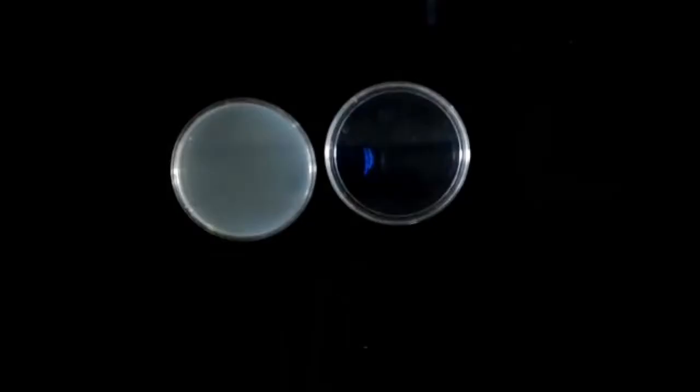In order to do module number 1, we are going to use 5 agar plates. We usually name the agar or the solidified material in the bottom of the plate because that solidified material can be one of many different things. For module number 1, the solidified material, what we're calling the agar, is a type of agar called tryptic soy agar.